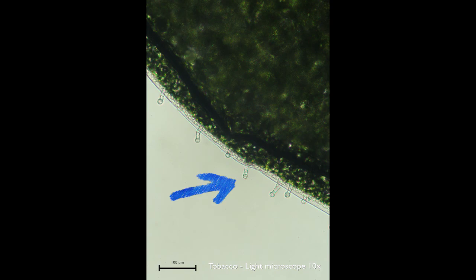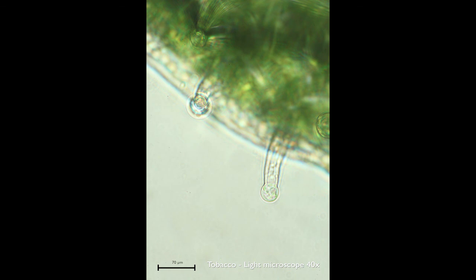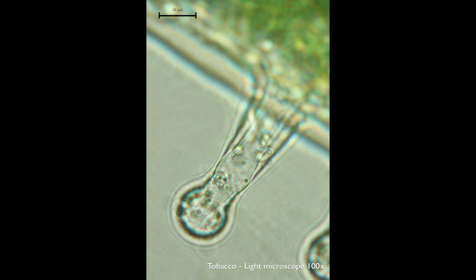Nicotiana tabacum, tobacco plants, have short and long glandular trichomes. There is evidence that tobacco trichomes play several roles in the defense against biotic and abiotic stresses. Some glandular secreting trichomes have principal functions of producing pest or pollinator interactive chemicals, which are stored or volatilized at the plant surface. There has also been direct demonstration of the biosynthesis of terpenes by isolated trichome glandular heads. Results suggest that glandular heads are the only site of biosynthesis of these compounds in tobacco.